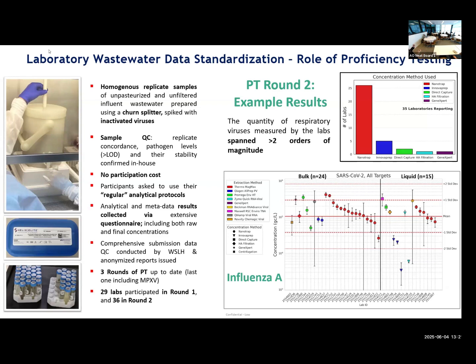We want to know about this first measles case, right? How well is our method going to perform at that low level versus at the limit of quantification or above? Hoping to get answers on that at some point, which will be more tricky.